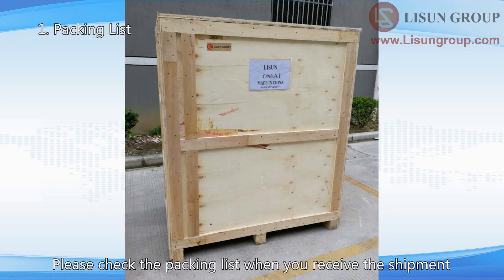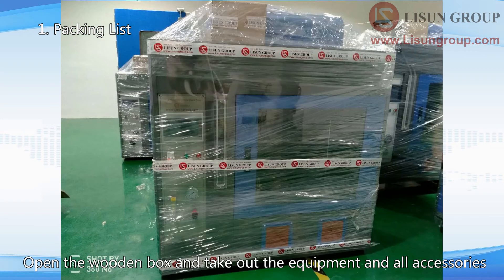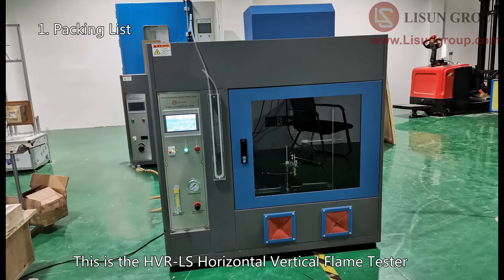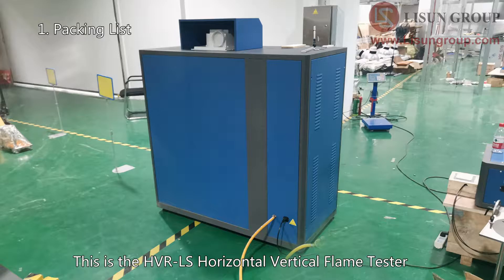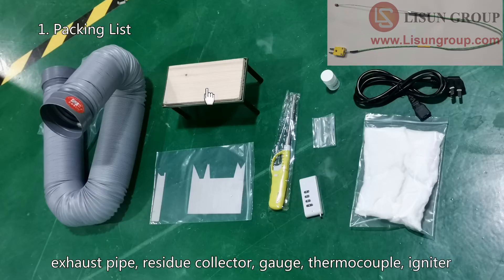Please check the packing list when you receive the shipment. The equipment and all accessories are in one wooden box. Open the wooden box and take out the equipment and all accessories. This is the HVRLS Horizontal Vertical Flame Tester. The accessory box contains an exhaust pipe and a residue collector.